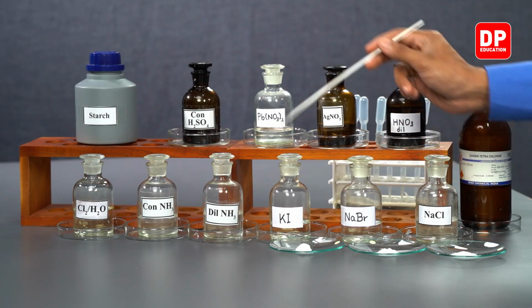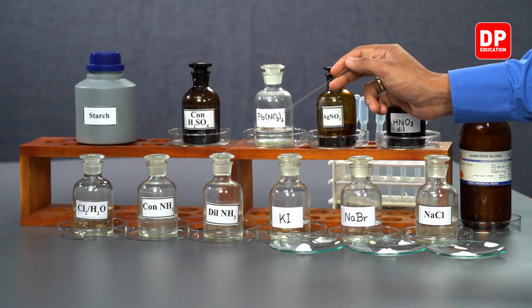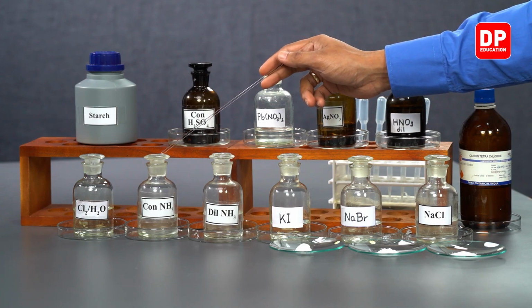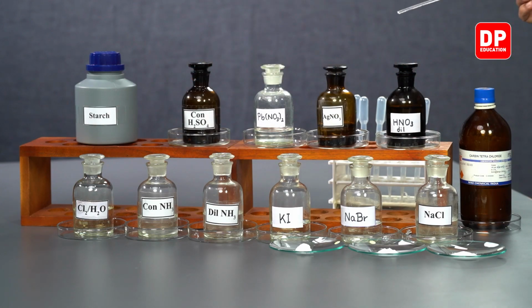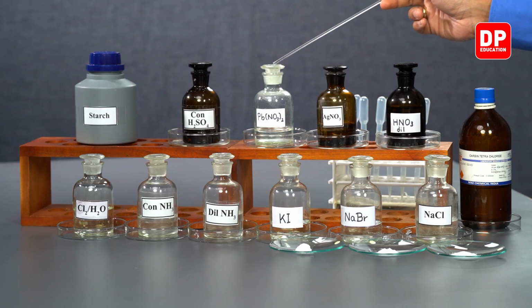Apart from that, we'll be using dilute ammonia, concentrated ammonia, chlorine water. We'll be using carbon tetrachloride, CCl4. We'll be using dilute nitric acid, silver nitrate solution, a lead nitrate solution. So in the practical, we will be able to use lead acetate or lead nitrate solution. In this case, we have actually chosen to use lead nitrate.